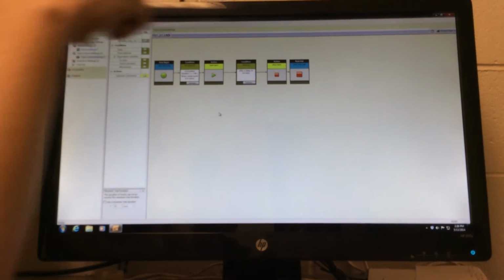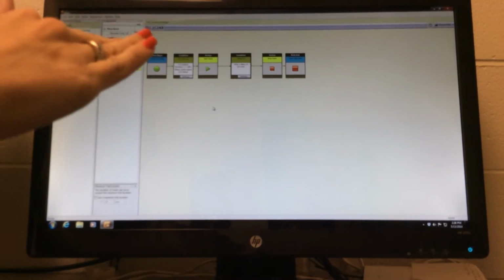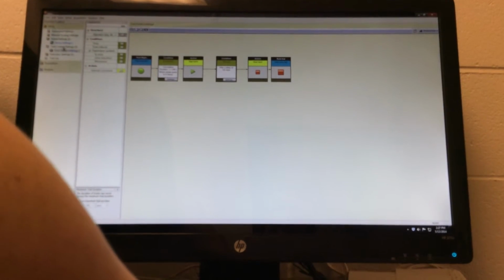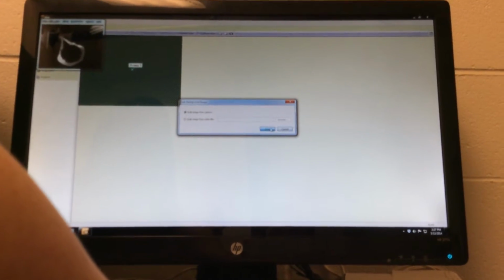Just take a background with the food in the different locations, pick the arena setting that you want, and use that one. So whatever you designate is the one the software will use. Okay, so how would you set another arena setting? You just right click on arena settings and hit new. Oh, okay. And then you can grab a new background image.